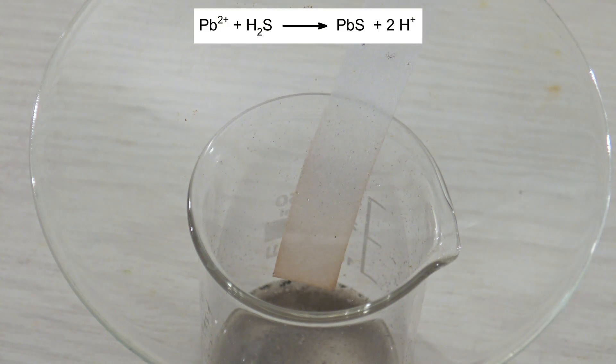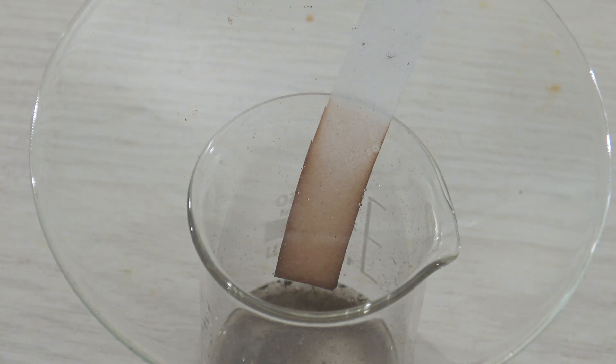The lead ions in the paper react with hydrogen sulfide to form lead sulfide, which leads to the paper turning brown or black. The formation of hydrogen sulfide is a proof that sulfides are present in the sample.